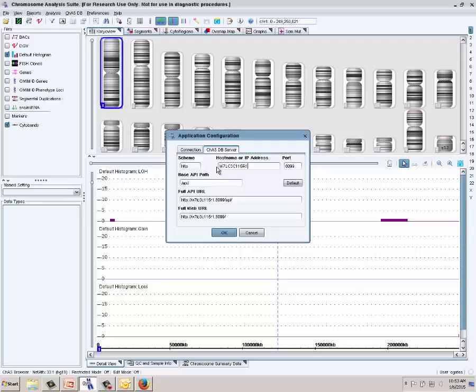So in this module, we learned how to do backups and restore, what it means and how to do working in offline mode, and how to add different users and their roles for accessing the ChAS database.